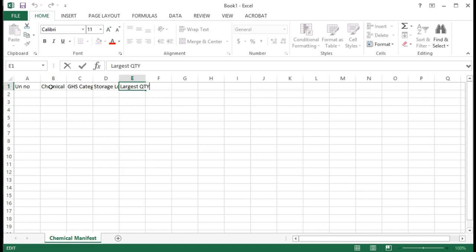It's up to you. I'd like to show you another neat trick now that I've learnt from using Excel, and that is to go to the next line at the start of the next row. Instead of clicking in there with your mouse, press Enter. Now this is why I use the tab key, because what it's actually doing is taking you back to the first cell that you started tabbing in. This is quite useful when you're doing data entry. If you are entering a number of values in a row, in say like 2 or 3 cells, and then you want to come back down to the next row and start in the first cell, so use tab and then return. It will save you a lot of time.